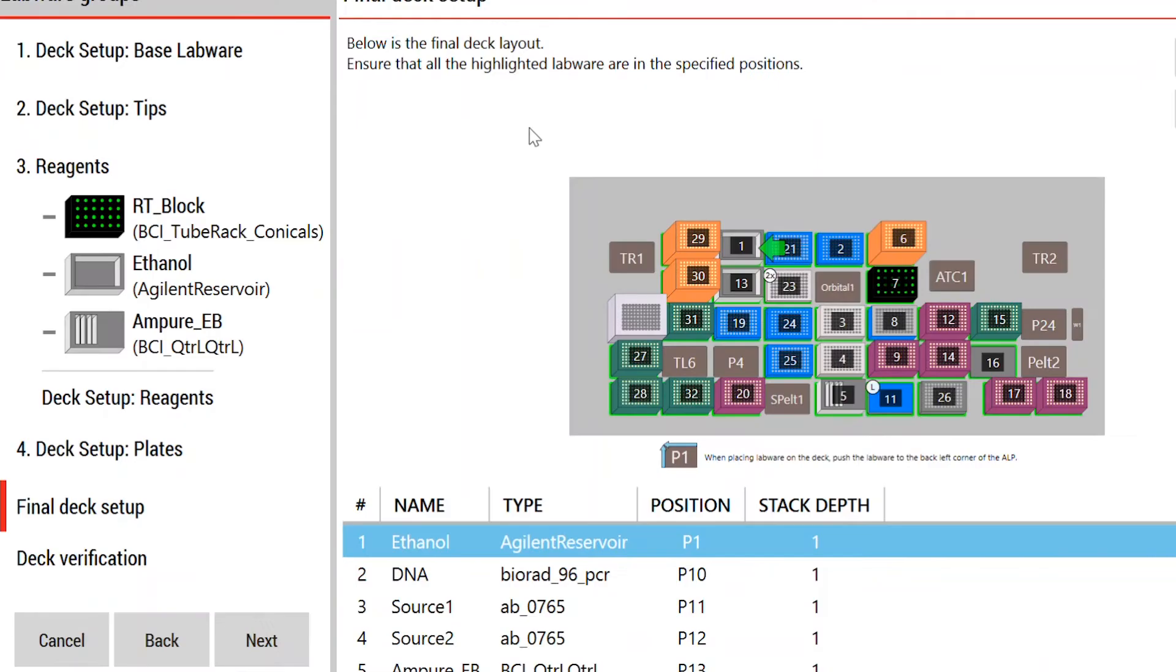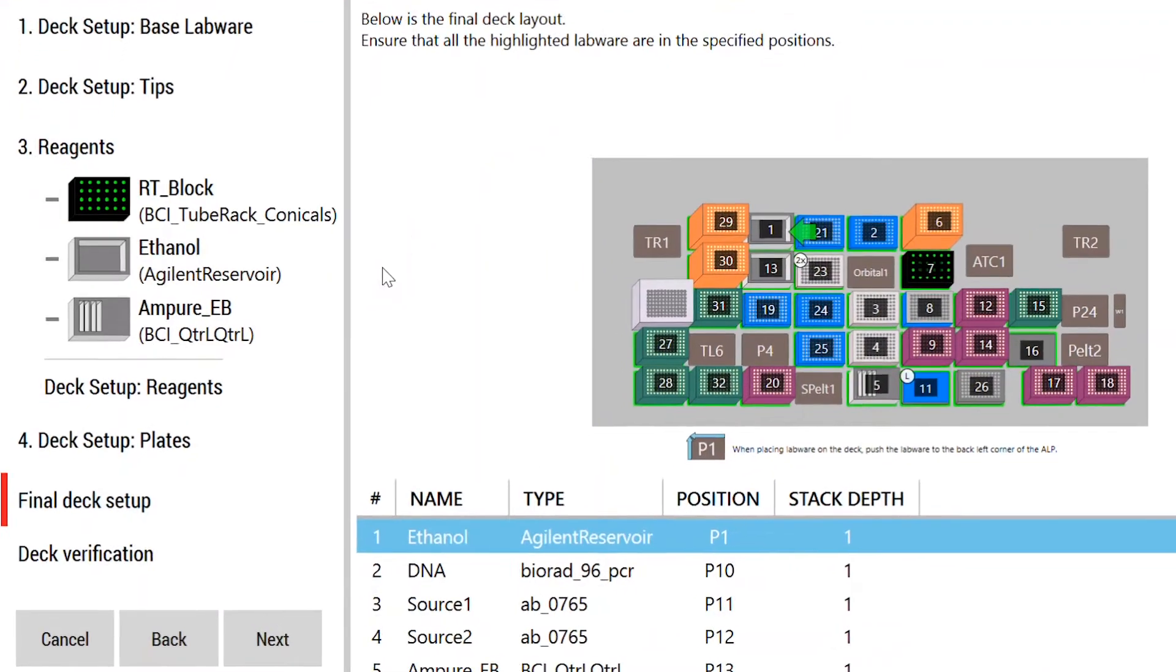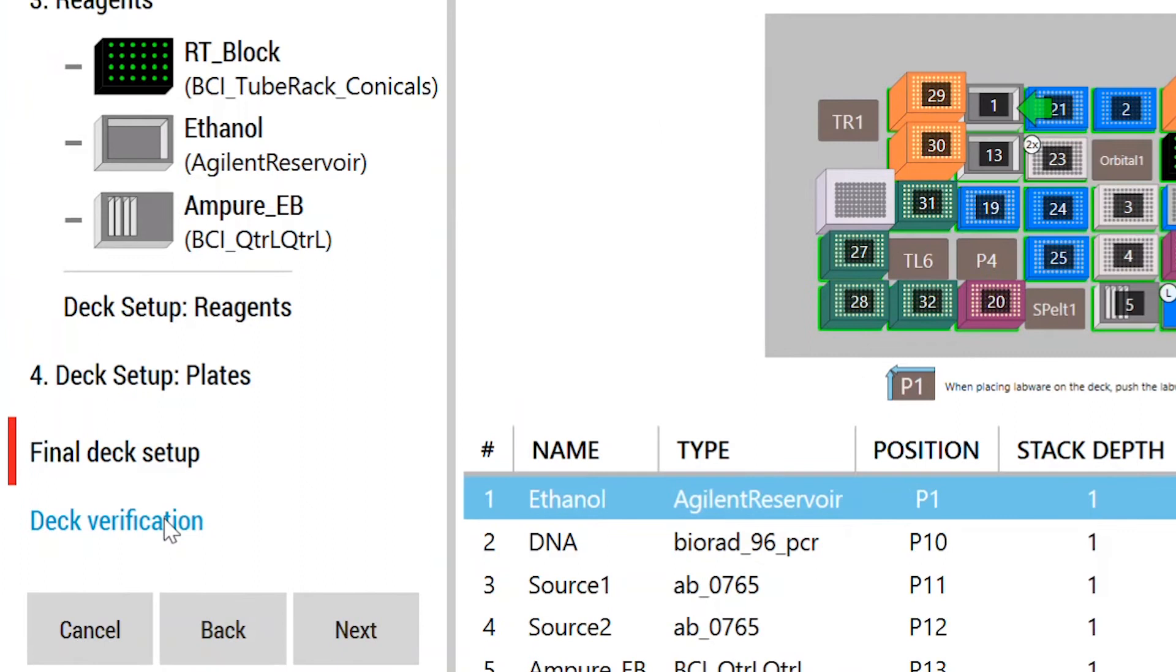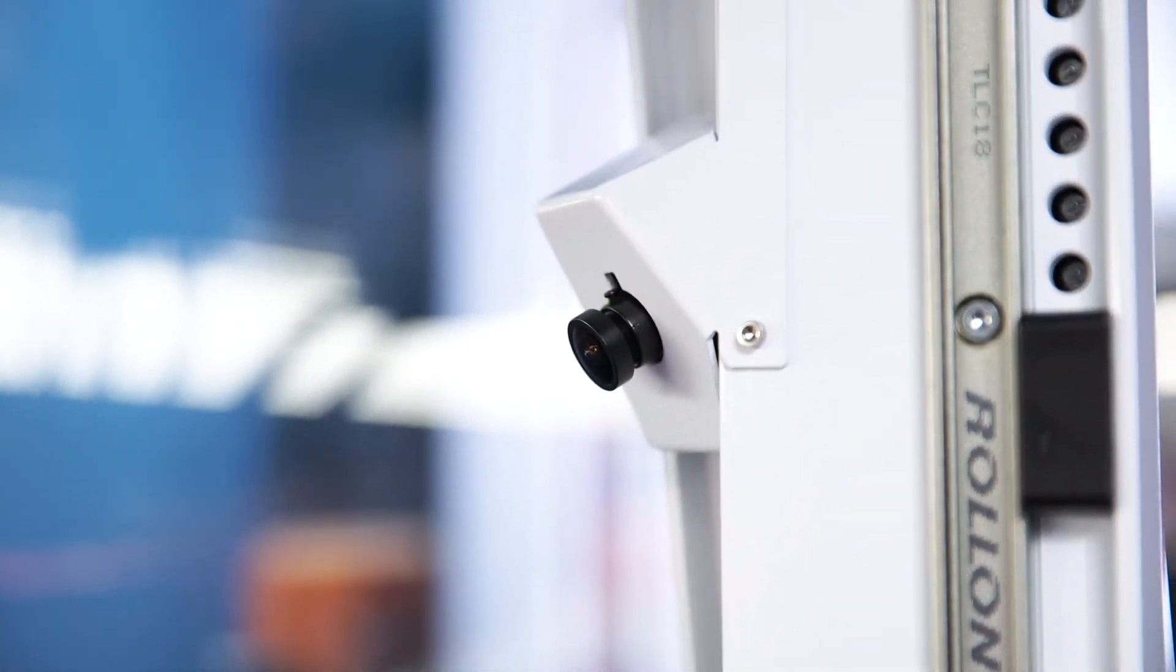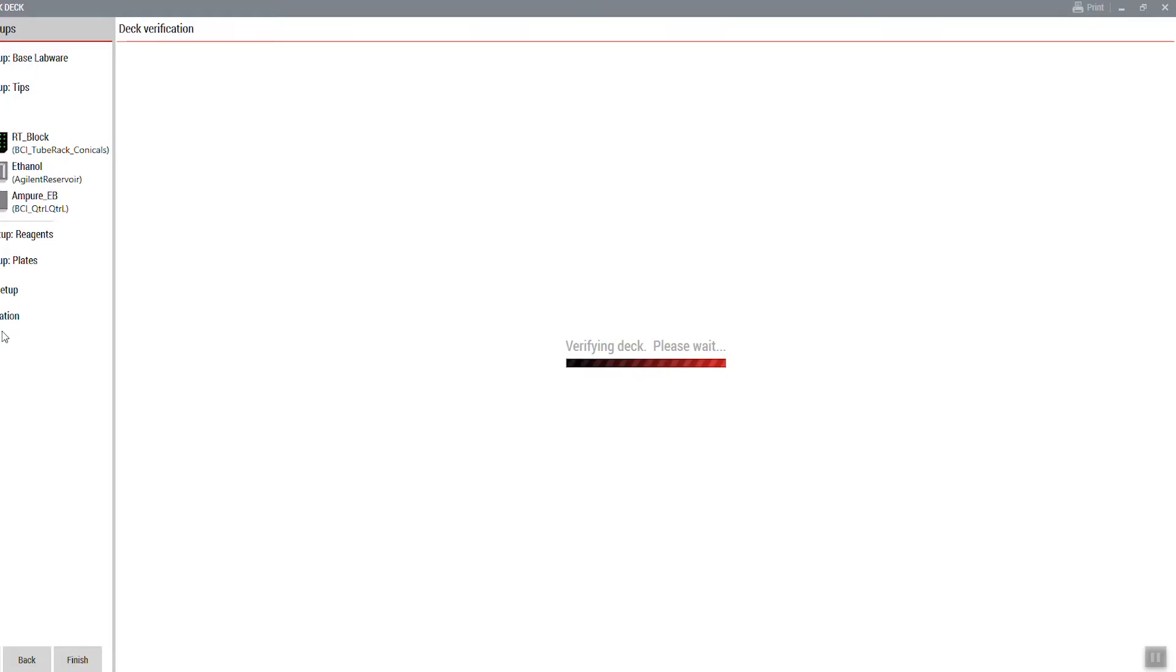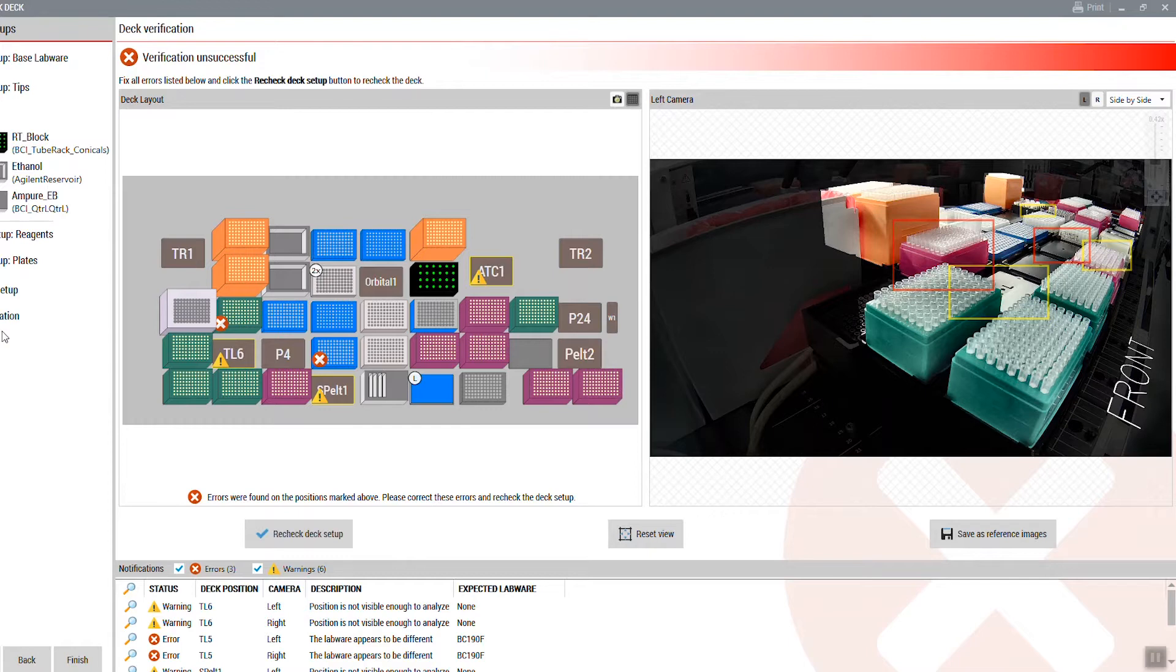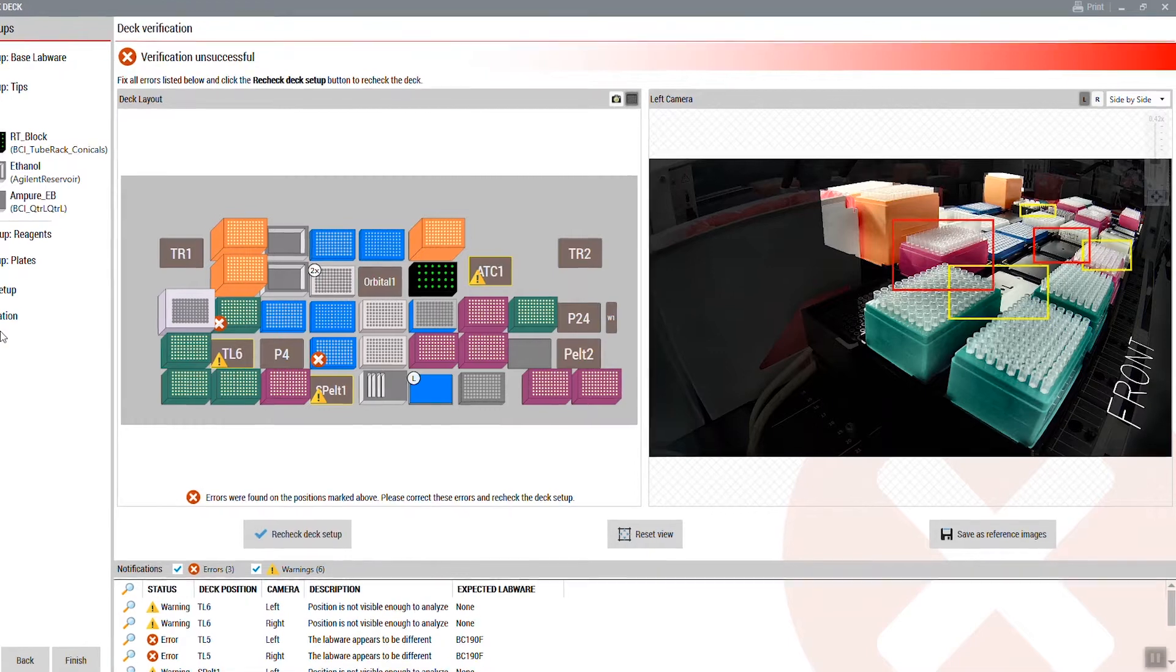Here's how it works. Once you complete setting up the deck, click Deck Verification. Final Check analyzes the deck using images collected by the DeckOptics cameras and details from your method. The verification process takes only a few seconds.